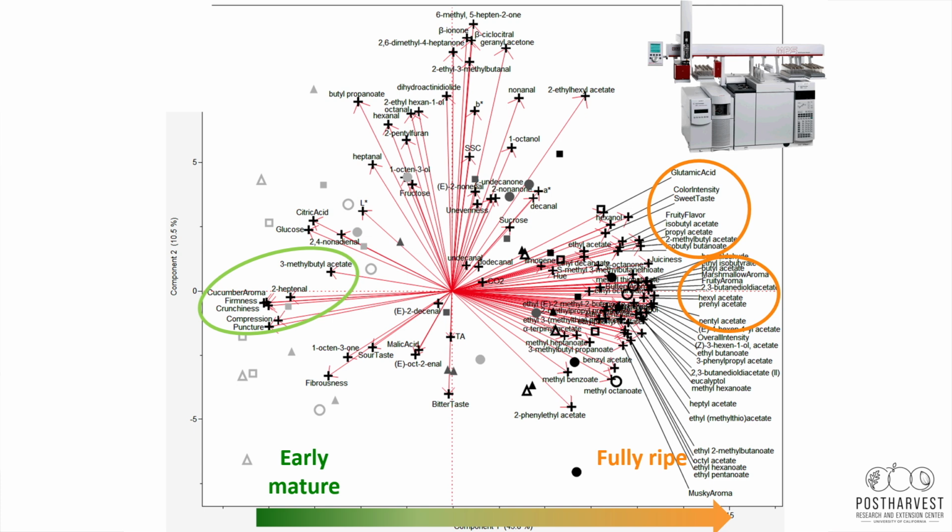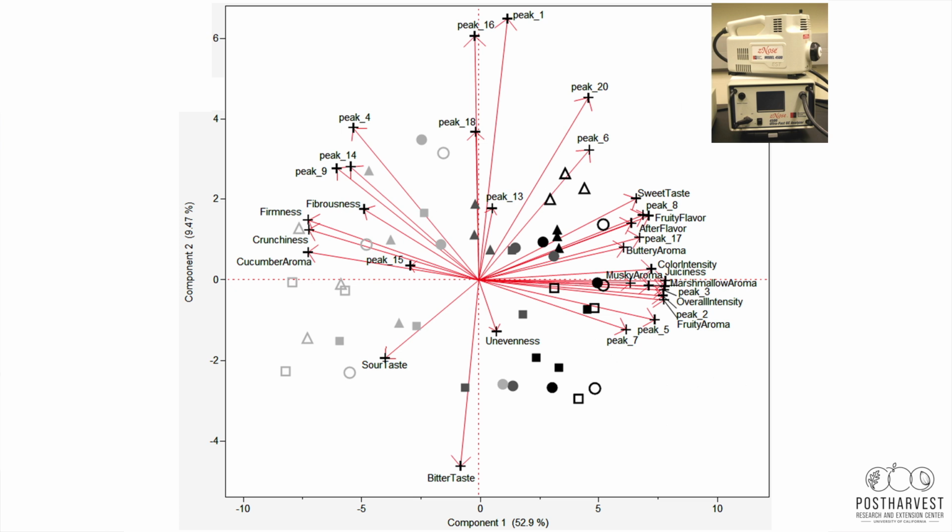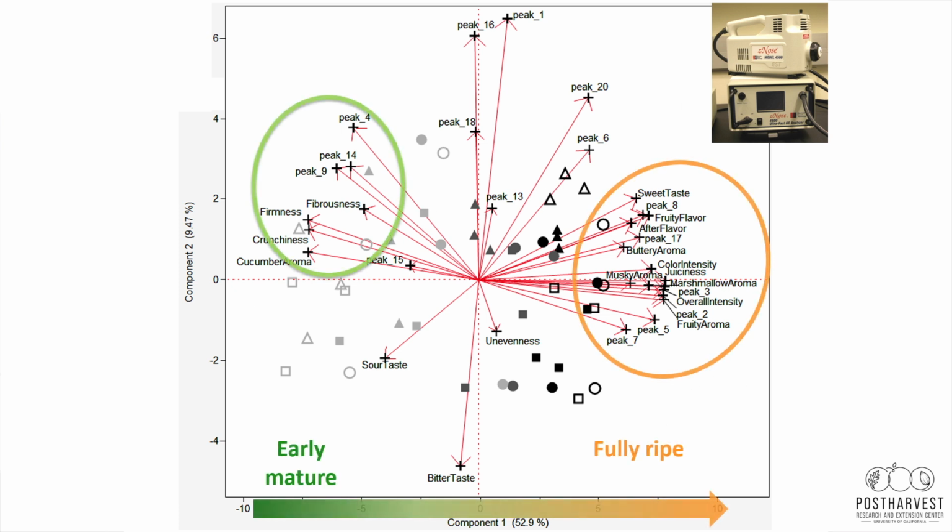We also tried to use an electronic nose to see if we could kind of simplify this. And it does simplify things a little bit. I won't go very much into it because unfortunately I don't think this instrument is really ready for showtime in terms of its usefulness for the industry.